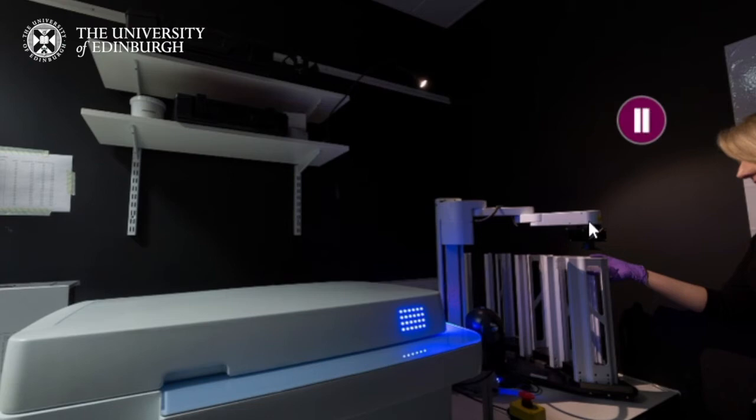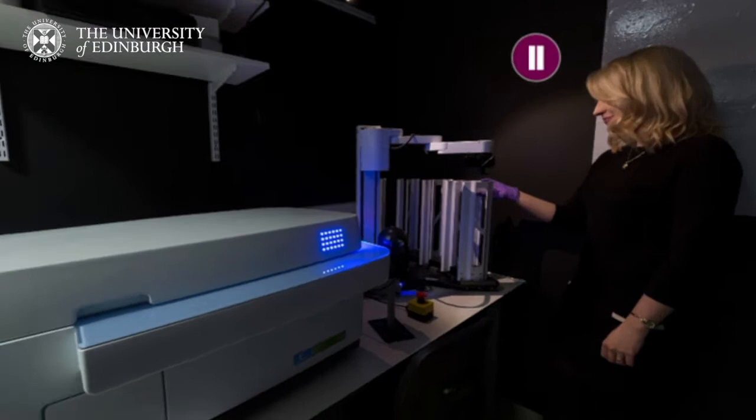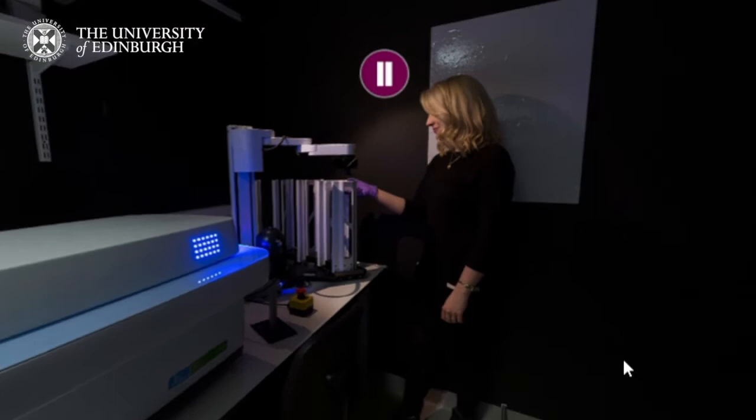High content imaging room. This lab houses an automated microscope that allows us to image both cells and tissues in plates and on slides. There's also a robot arm which loads and unloads large batches of plates so that we can screen millions of cells for genes that may be important in diseases or screen compounds that could help to cure those diseases. Click on the links to find out more about phenotypic screening.